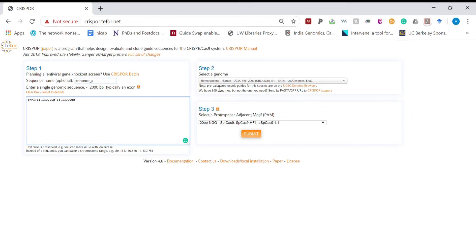Then select a type of genome. Here our genome is homo sapiens, so it is already selected. Next look at the protospacer adjacent motif and then click submit.